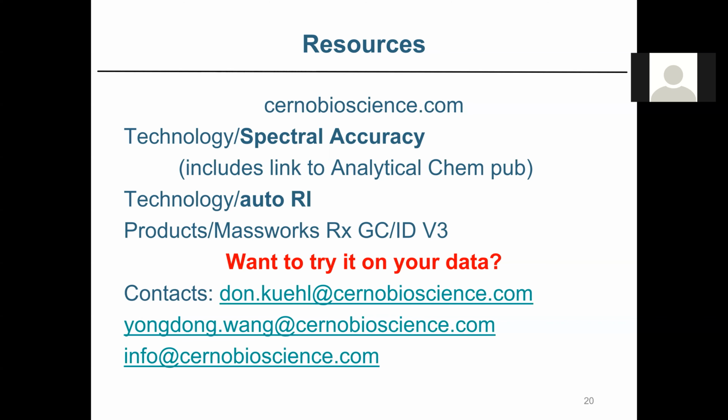If it's not necessary, and you really just want to, again, you saw what you could do with just using forward and reverse search, and what the computer can do as well, using retention index data. That in itself is a big step up from just looking at a search. So that's why we support centroid data as well. I would say profile is preferred, but if it's not convenient or doesn't fit into your workflow, you're still going to get a big advantage in additional information for trying to ID unknowns.